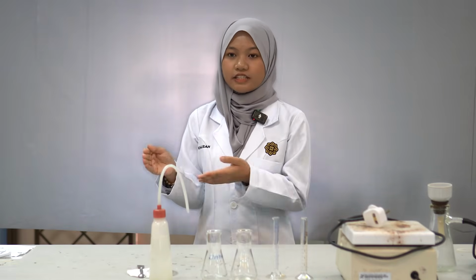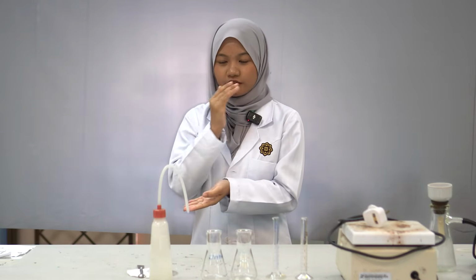The most important step in this process is choosing a good solvent. If the compound is known, we refer to the literature. If the compound is unknown, we test several types of solvent to find the most suitable one for the compound. Then we follow the rule "like dissolves like", which means polar compounds dissolve best in polar solvents, and non-polar compounds dissolve best in non-polar solvents.